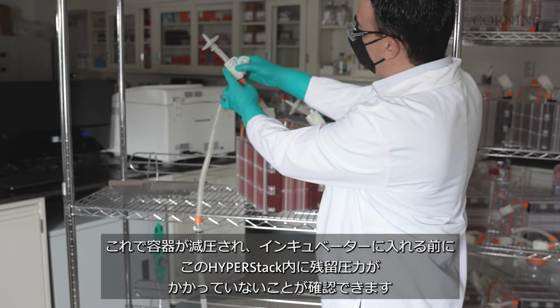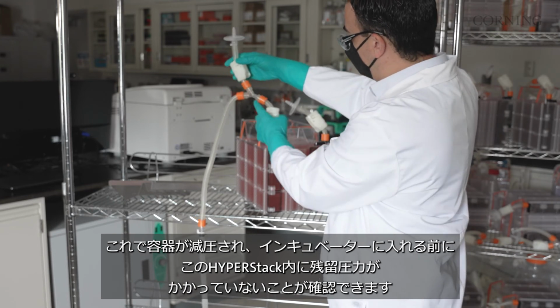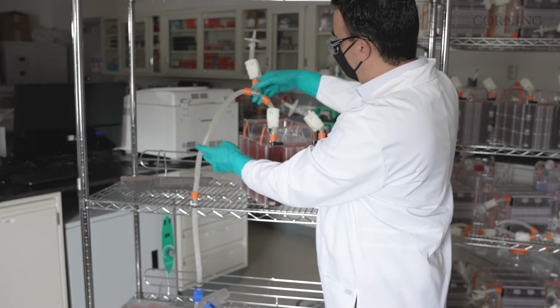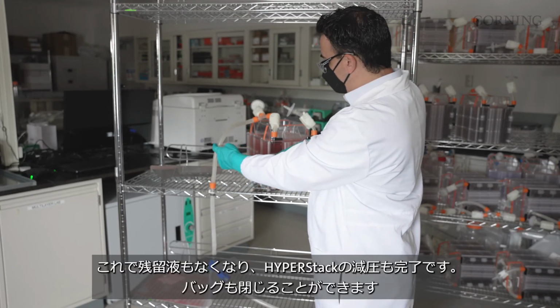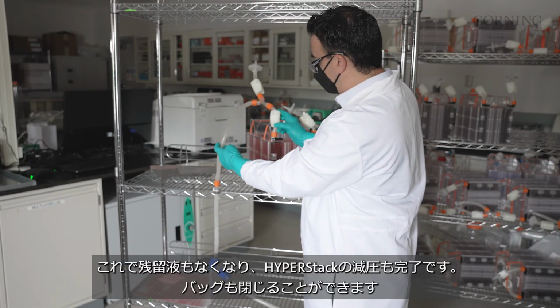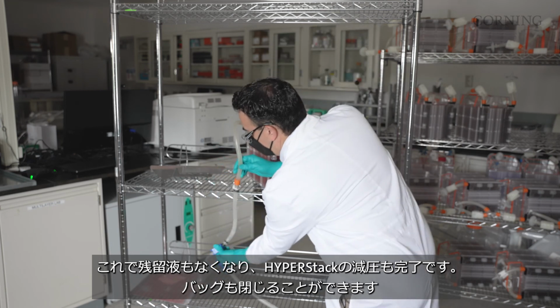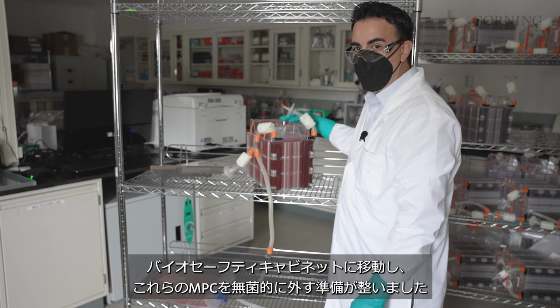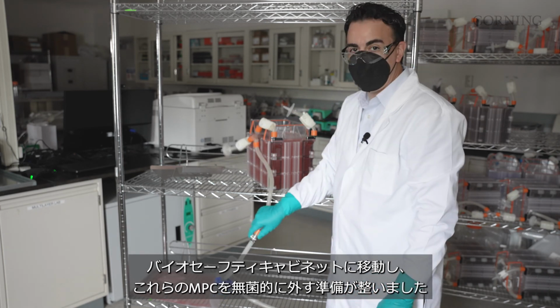This allows us to depressurize the vessel, make sure there's no residual pressure trapped in this HYPERStack before it goes into the incubator. Now that we've chased the line, we've also depressurized the HYPERStack. We can go ahead and close our bag. Now we're ready to move into the biosafety cabinet to make a sterile disconnect of these MPCs.